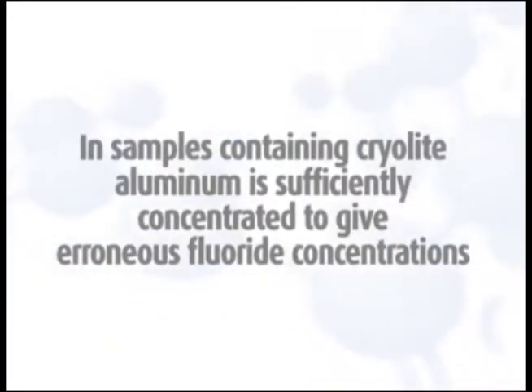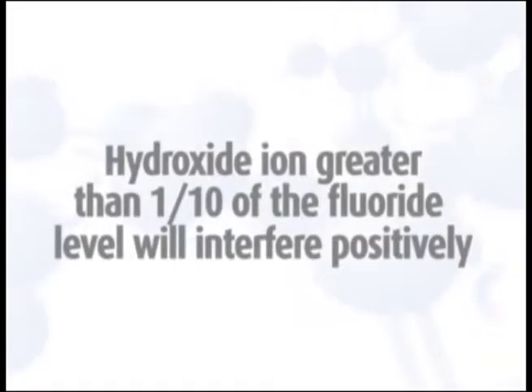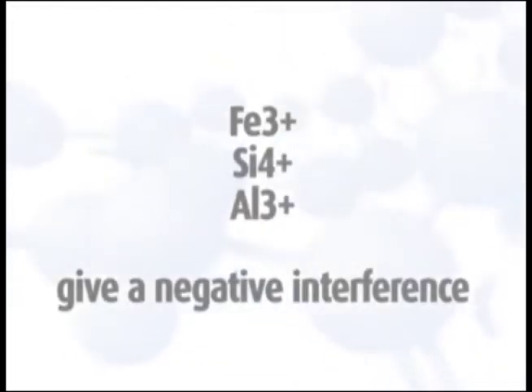In samples containing cryolite, aluminum is sufficiently concentrated to give erroneous fluoride concentrations. Hydroxide ion greater than one-tenth of the fluoride level will interfere positively. Iron 3+, silicon 4+, and aluminum 3+ give a negative interference.